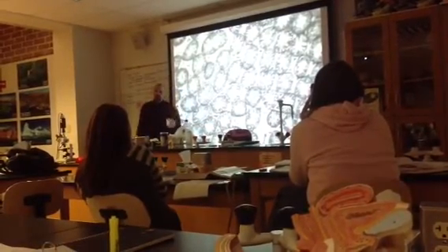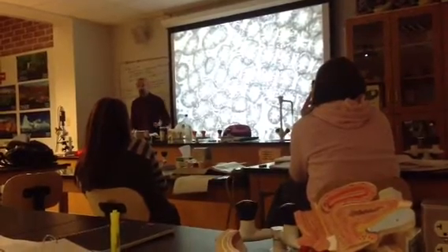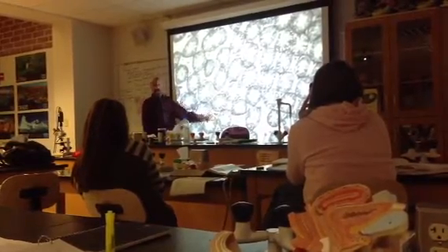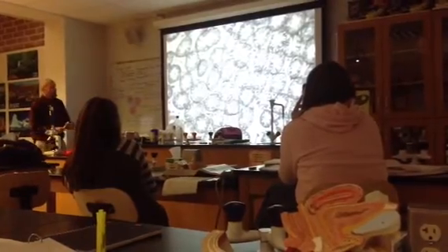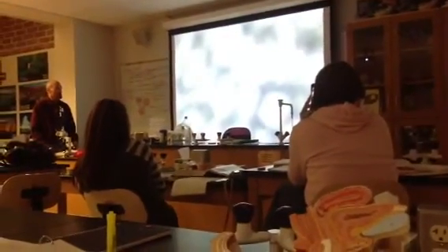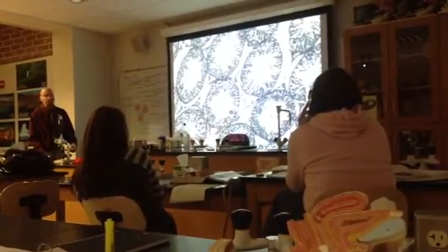They go by a couple different names: Leydig cells, interstitial cells, or interstitial cells of Leydig. But these are all the cells that secrete testosterone. So this is the testes' primary source of testosterone. And let's blow this up one level here, get a closer look. This is mostly just memorizing the names of the cells and the location of where the cell is.